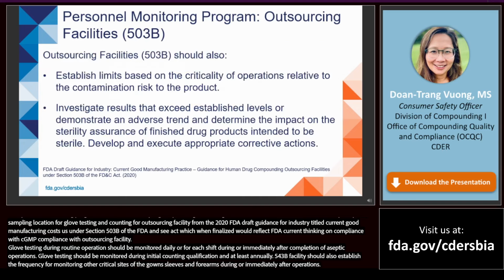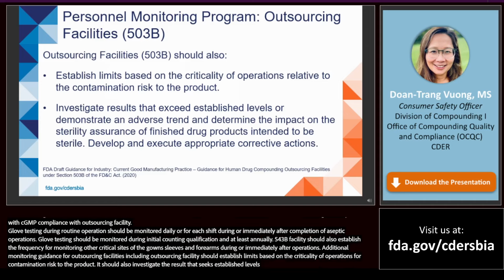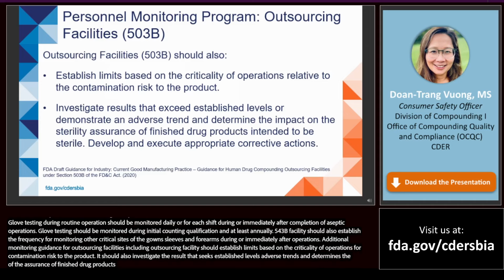Additional personnel monitoring recommendations from the 2020 draft guidance for outsourcing facilities include that outsourcing facilities should establish limits based on the criticality of operations relative to the contamination risk to the product. They should also investigate results that exceed established levels or demonstrate an adverse trend, determine the impact on the sterility assurance of finished drug products intended to be sterile, and develop and execute appropriate corrective action.